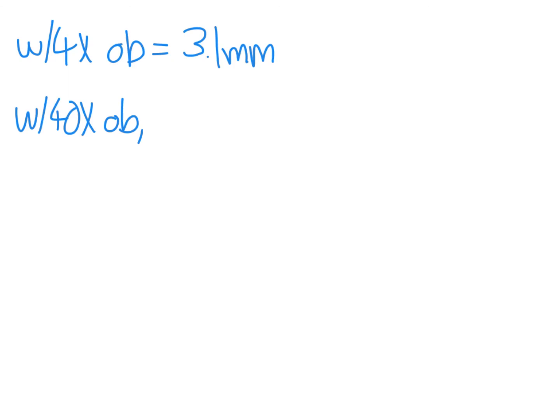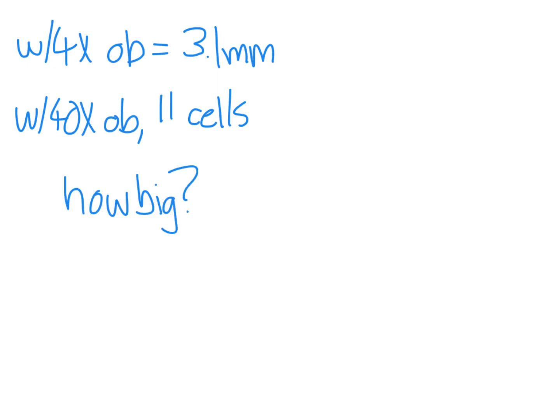Okay, one final practice problem. Say under the 4x objective, the field of view is 3.1 millimeters. Under the 40x objective, about 11 cells could lay across the field of view. About how big are those cells? Pause here and try to solve it.